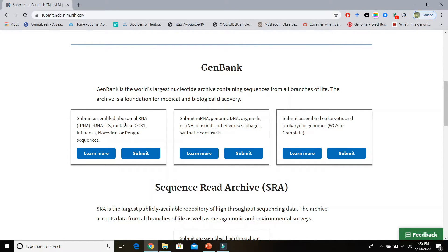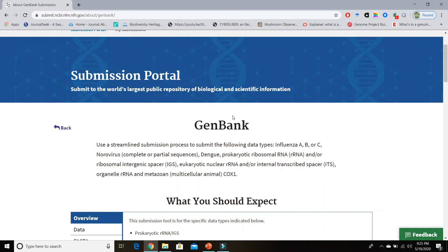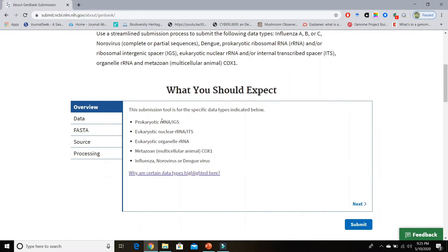The first tool is the Submission Portal of GenBank. To see more information about this tool, click on the Learn More button — it will open the GenBank Submission Portal tool page. Here you can see the description about the Submission Portal: what kind of data you can submit through this tool, and down below you can see the overview about this tool.